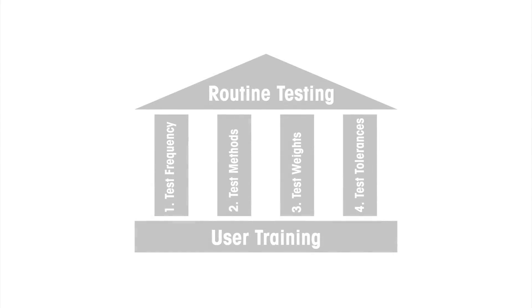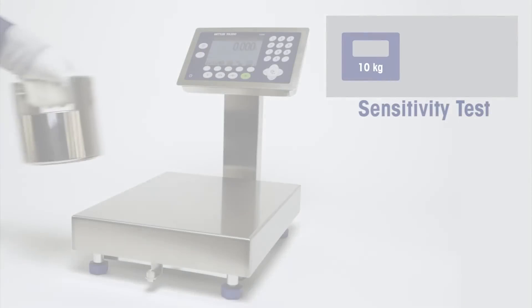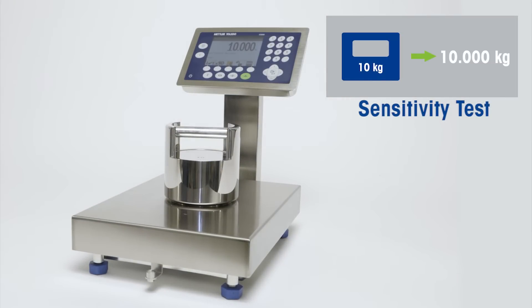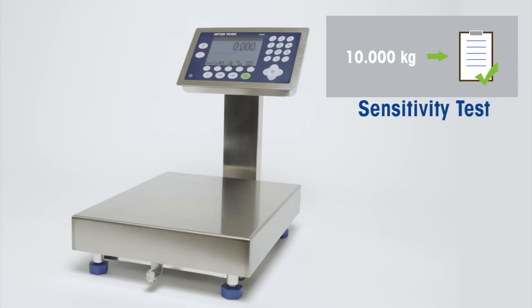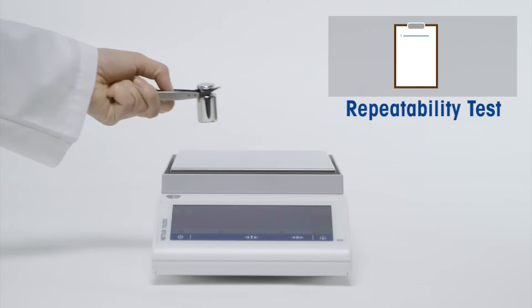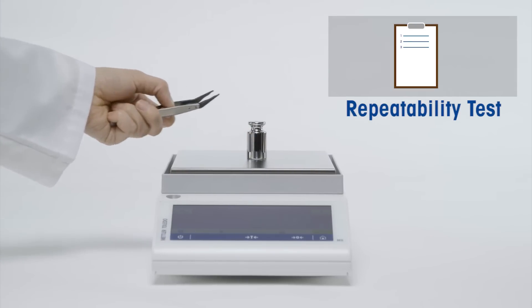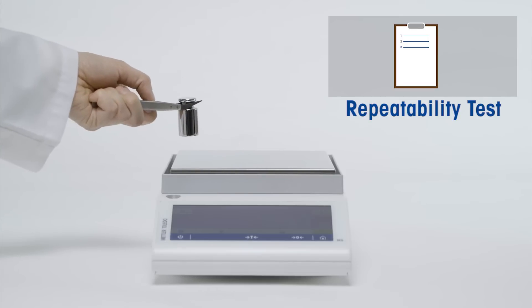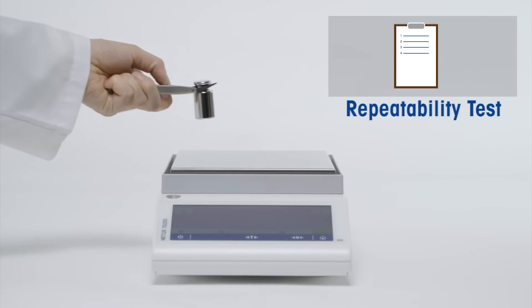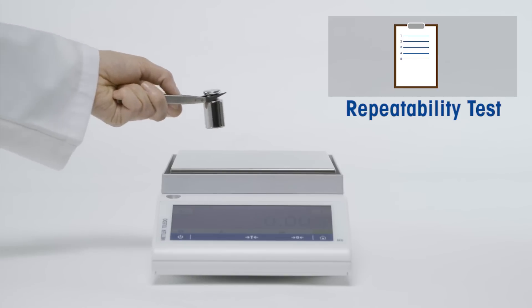The second pillar involves your test methods. To verify the performance of your weighing device, there are three different tests that need to be run. Sensitivity tests are quick and simple — sensitivity is measured by comparing the indicated value to the reference weight value by placing a calibrated test weight on your balance or scale. The repeatability test checks the ability of a balance or scale to supply the same result with repeated weightings using the same load under the same conditions. It is usually measured by six to ten consecutive measurements, and a standard deviation is then calculated. Repeatability tests are usually done less frequently than sensitivity tests, but are important especially when measuring small samples or ingredients.